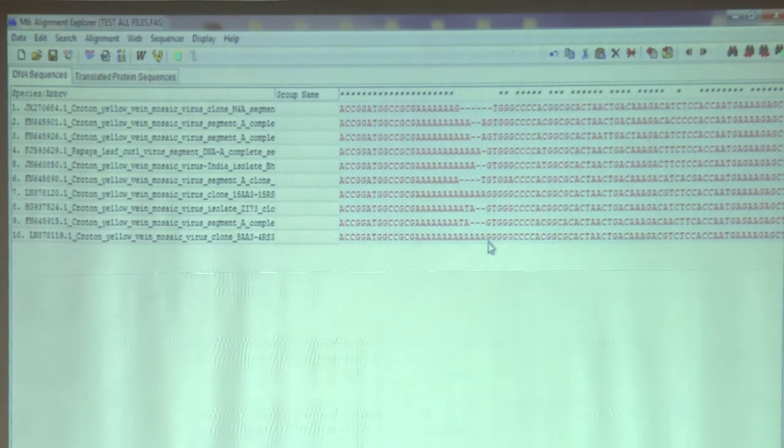Otherwise, you understand, that is the most important point, especially if you are handling whole genome data. Every base has been given a specific coordinate, right? If it is a 6 MB genome, from the first base to the last base, specific numbers are allotted serially. So if you are taking a set of data, remember the first base should represent the same coordinate. You understand? That is very, very important. The same base position, and in the same way, the last base is also the last base coordinate. Same length is fine, but they should represent the same base call.